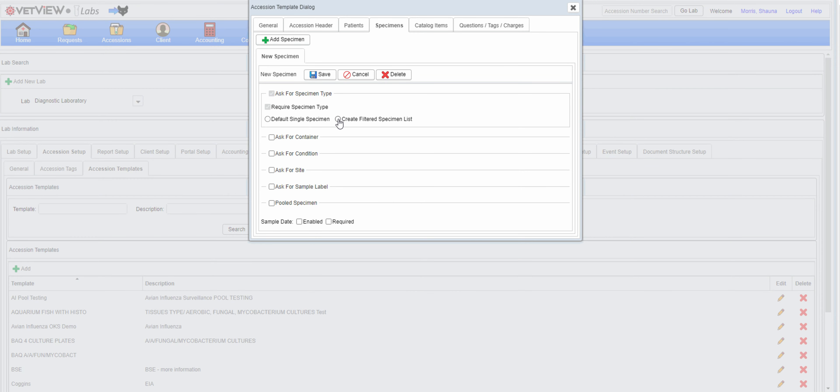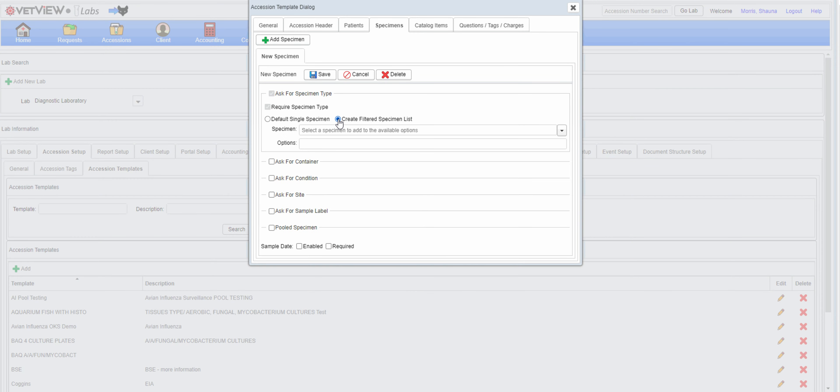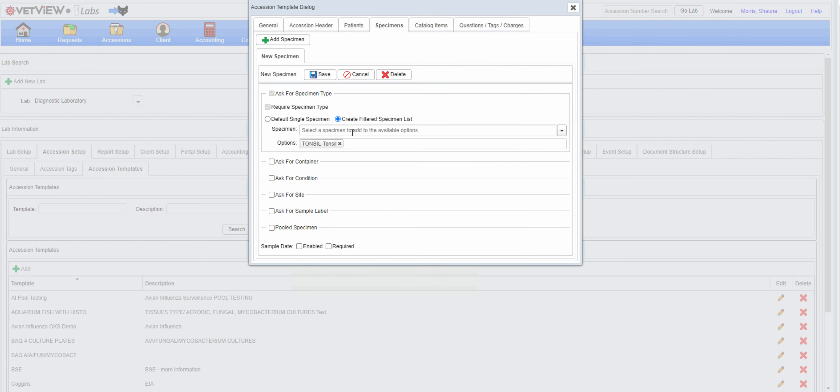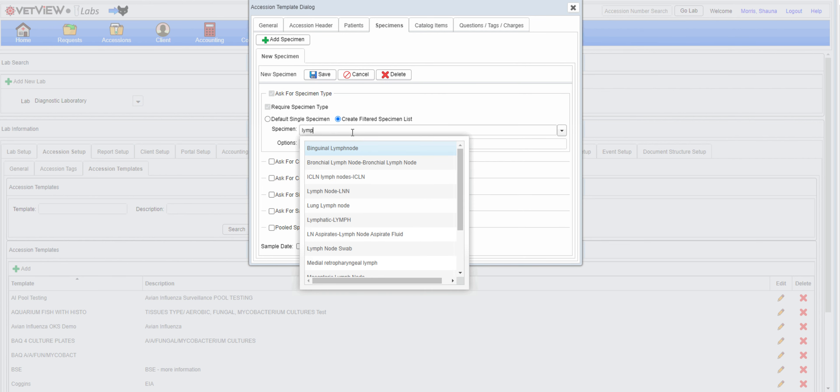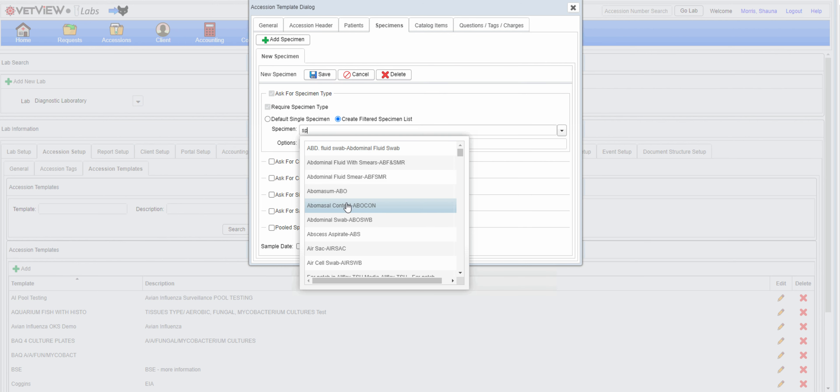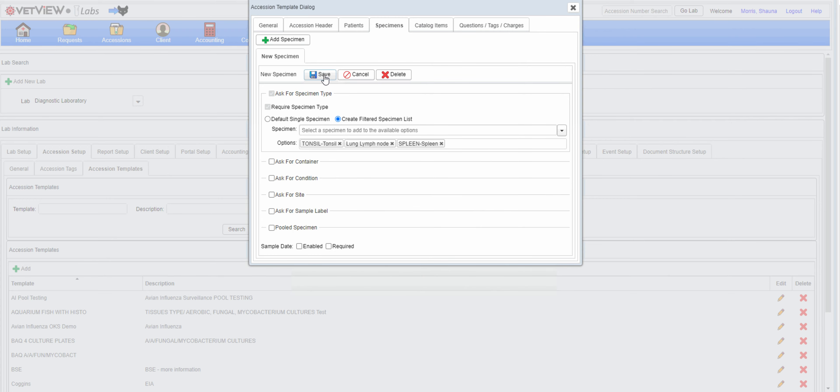Certain programs may only allow a select specimen list. You can allow free specimen entry, create a short list, or restrict to a single specimen. Specimen labels or collection dates can be prompted or required.